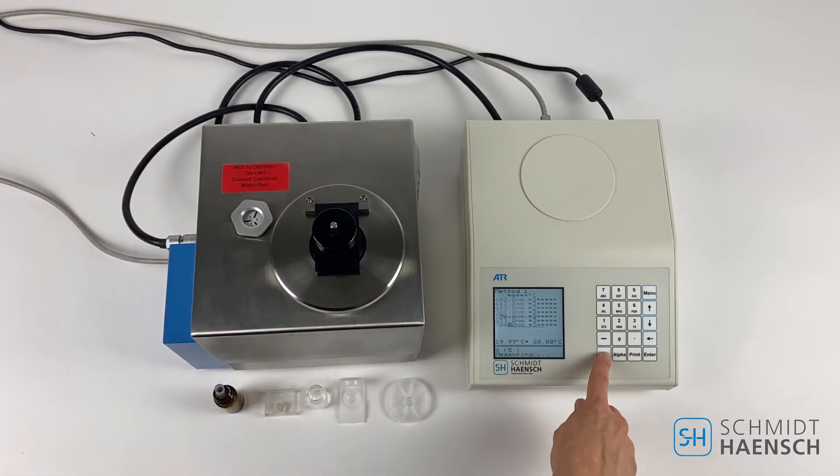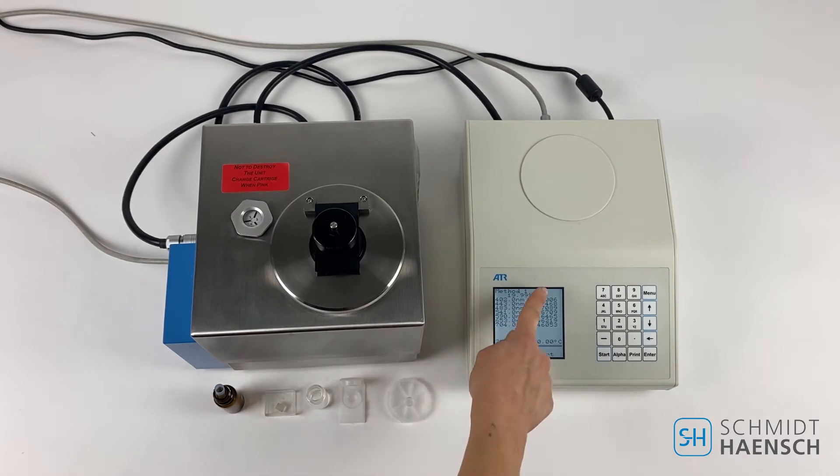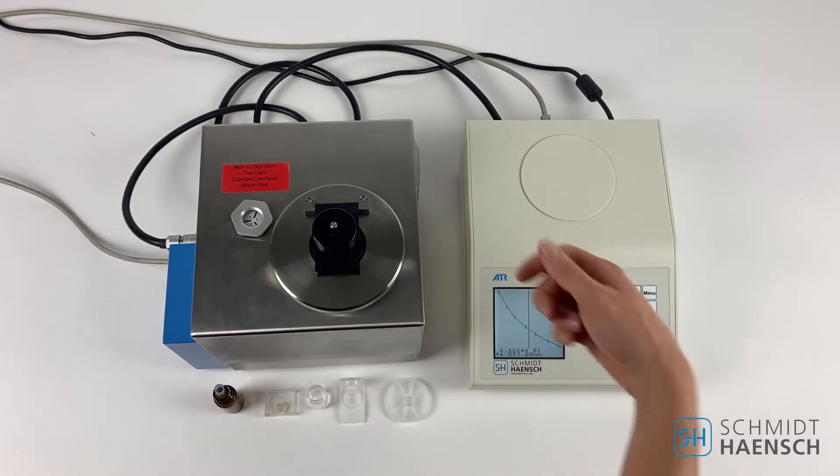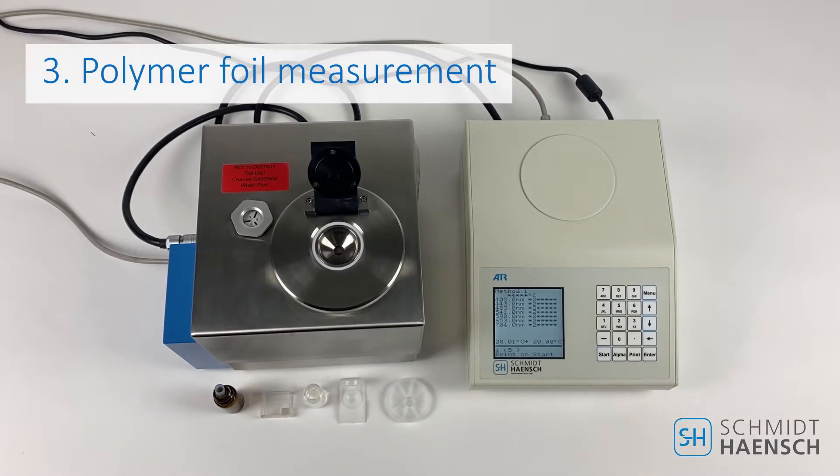Press start and see the measurement results within 20 seconds. You can expect wavelengths on the left side and corresponding refractive index on the right side. To visualize the results press the arrow button.